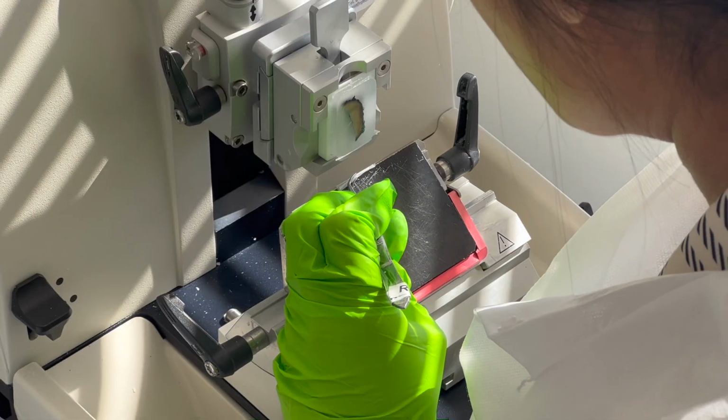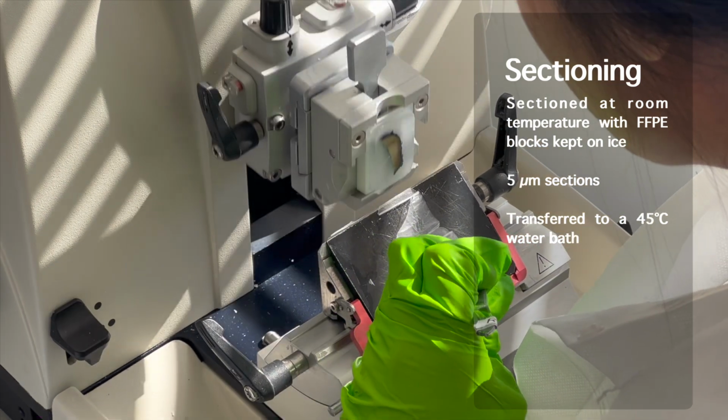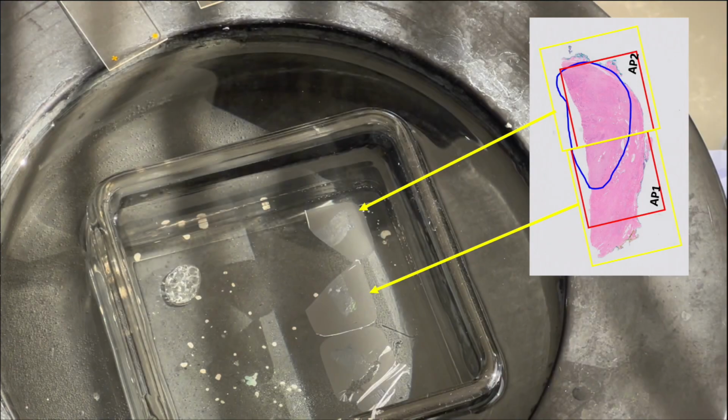Using a microtome, 5 micrometer sections are cut from the FFPE block at room temperature. The sections are carefully transferred to a water bath which is kept at 45 degrees Celsius. Here, we illustrate how the score incision on the FFPE block allows for precise separation of the section according to the digitally planned schema.